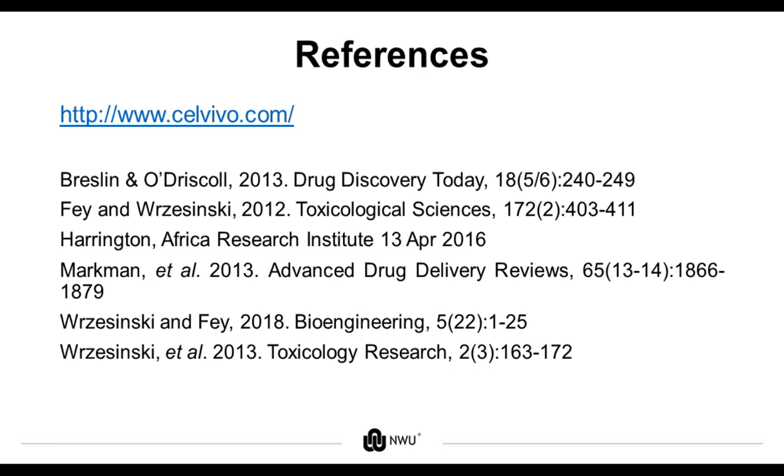Okay, let me just understand the question. So you want to know if we use a 24 well plate. A well can make up to 1,000 spheroids. That means that there are 1,000 cells in each micro well, which gives you 1 spheroid. So it depends. The AggreWells we buy are a 24 well plate, but you can get around about 1,000 spheroids out of 1 well.